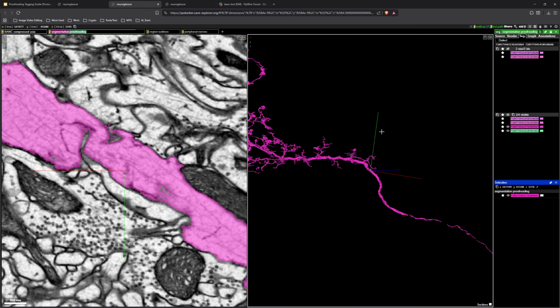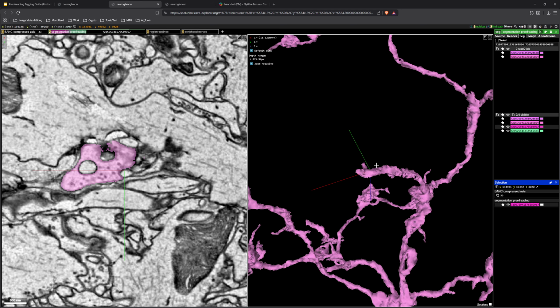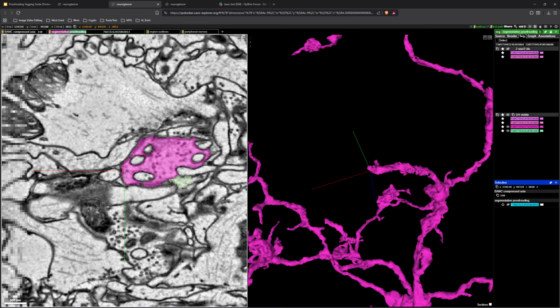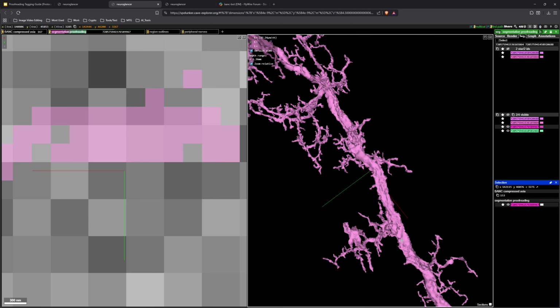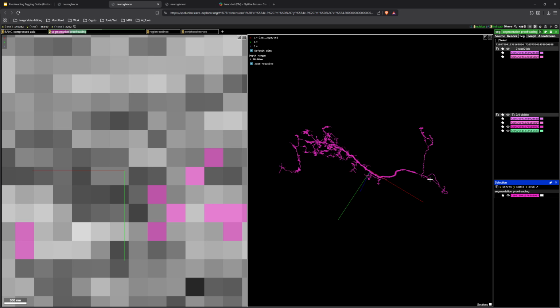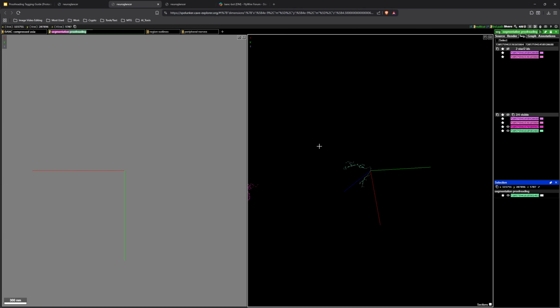So given that, you give it a once over, make sure there's no extremely obvious extra branches or anything. Check all the tips of the ones that are suspicious to you. And then once you've done that, give it a chance to look for the Soma. I sort of cherry picked these two. These were the first two can't trace to Somas that I looked at, and I was able to find the Soma to both of them.